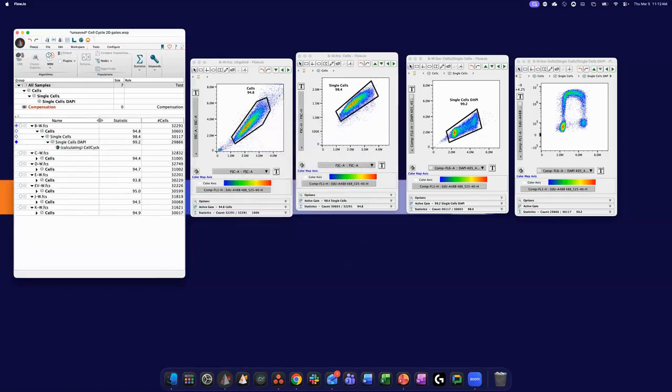It's going to take a minute to run because basically what's happening is this algorithm is looking at the density of this plot. Where are there regions where there's a lot of red, yellow, green, where there's a lot of cells in the same area of the plot? Then it focuses on those areas and looks at the distance of events in those areas. Based on the distance, it says, these are really far from these, so they must be their own classification. These are really far from these and these, so they're their own. So it's just classifying the events based on where they're found in the plot, a kind of probability of where a cell should be based on its location.